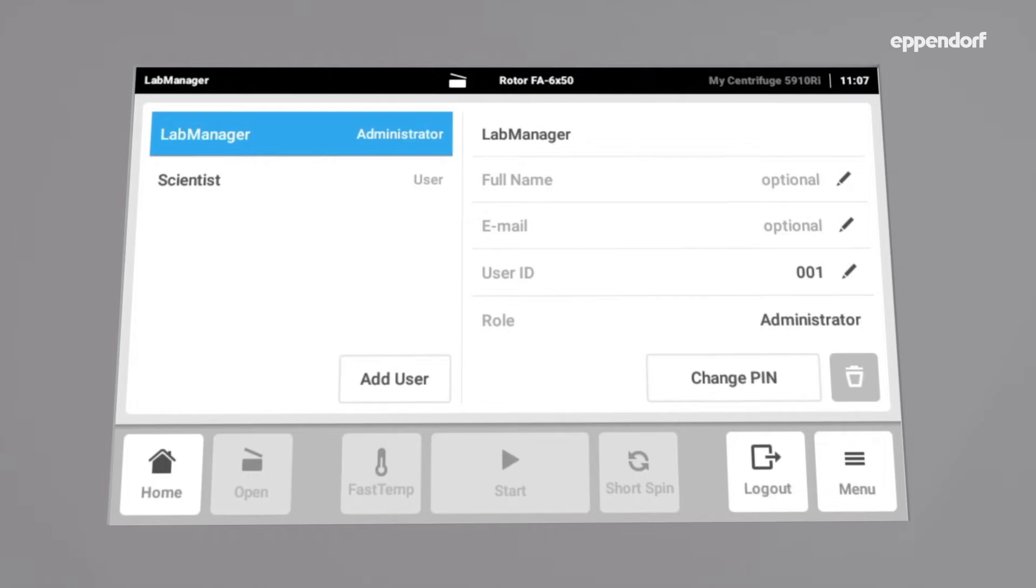Secondly, the User, a role with a range of rights to fully operate the device without the ability to change essential functions.